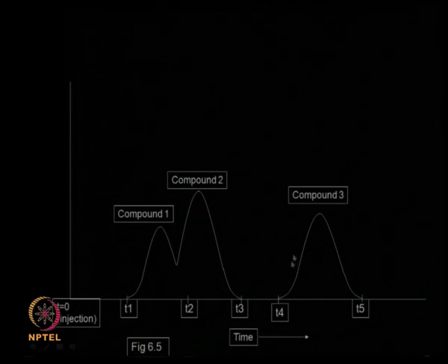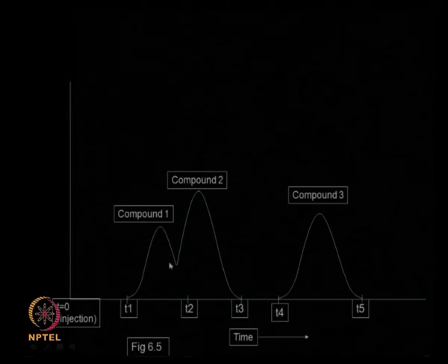So we can collect this and we can assume when we collect it will be 100%. But let us look here, we have both compound 1 and compound 2, or protein 1 and protein 2, partially mixed together. So when I collect samples in this region I may get compound 2 also present, or when I collect here I may get compound 1 here also.